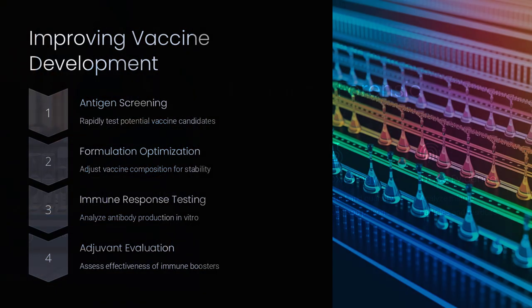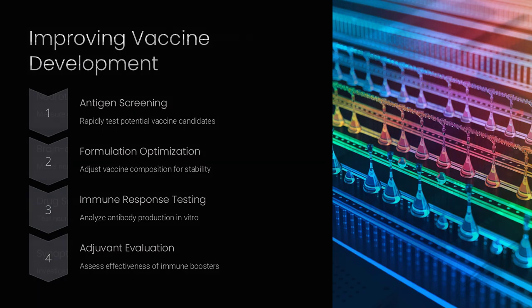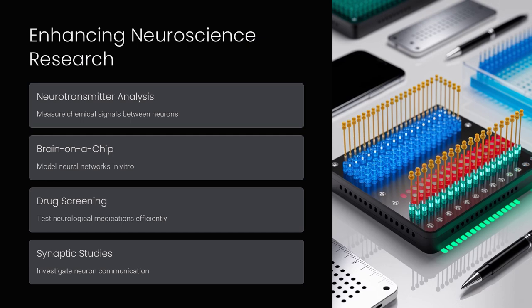One of the key advantages of digital microfluidics is its ability to miniaturize and integrate multiple laboratory processes onto a single chip. Traditional lab workflows often require a series of manual steps, from sample preparation and reagent mixing to incubation and detection. With digital microfluidic platforms, these steps can be automated in a seamless sequence. For instance, a droplet containing a biological sample can be directed to merge with another droplet holding a specific reagent and then transported to a sensing area for analysis, all without human intervention.